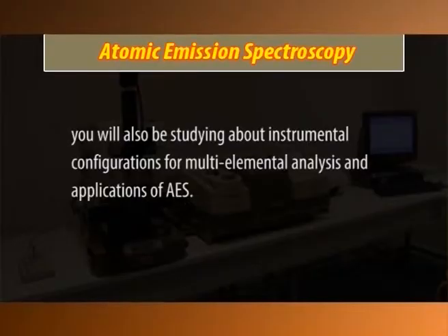Dear students, you will also be studying about the instrumental configurations for the multi-elemental analysis and applications of AES. Lastly, we will wind up the module with the conclusion.